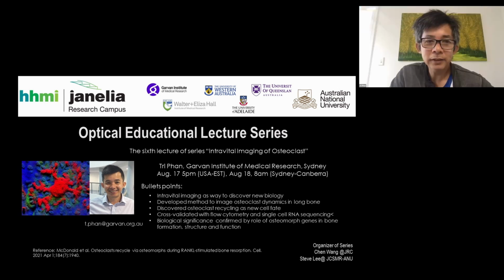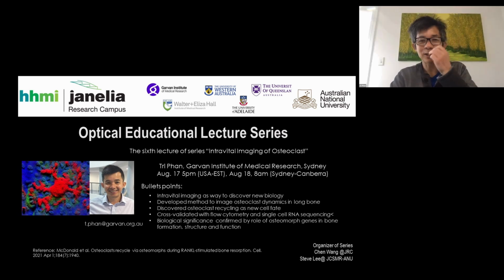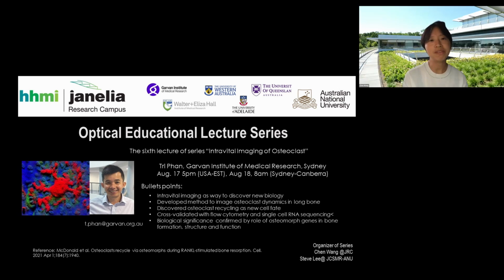Hopefully our new microscope with the adaptive optics will be online in a few months, and I'll send you the first experiment. Oh, I see, so you haven't tried yet. No, we haven't tried yet. It's all what we're hoping to do, the sort of solutions that we're hoping might help us. I see. I imagine that will be very helpful to address the refractive index mismatch.